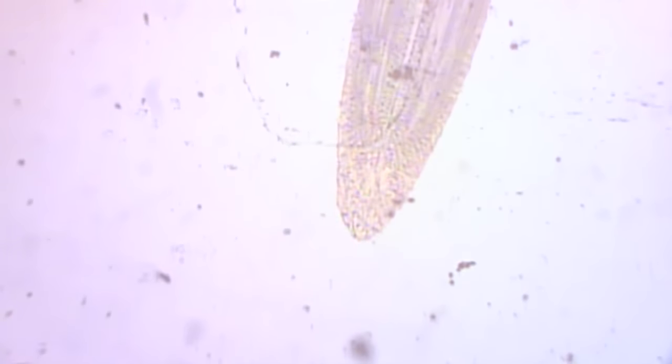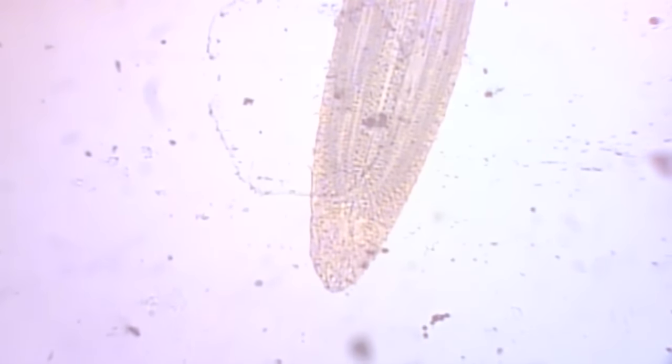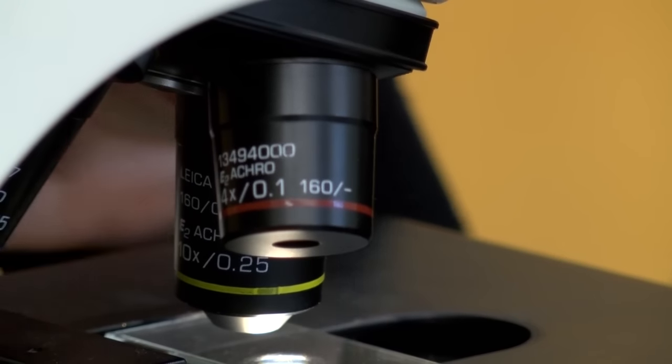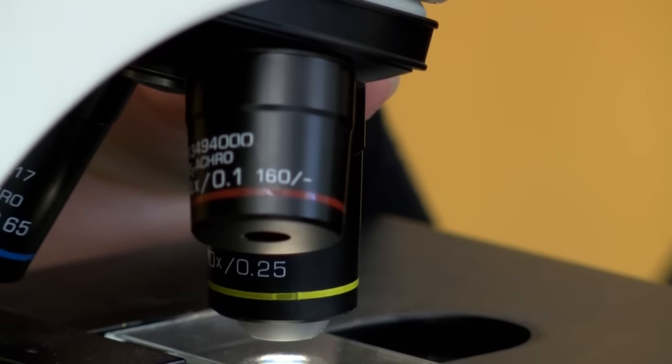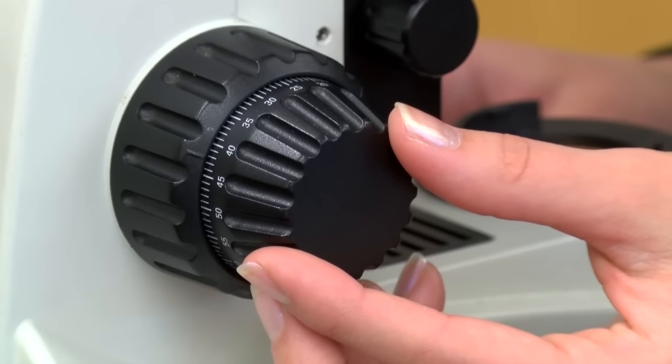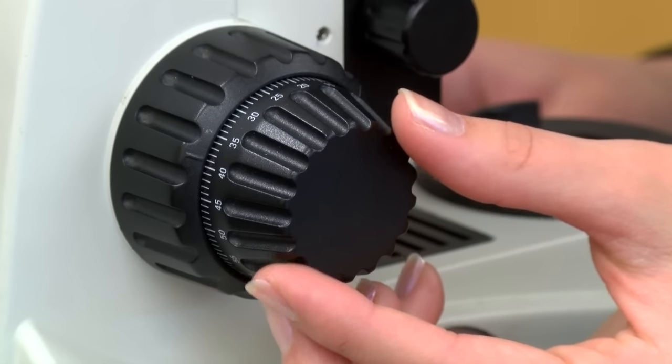Once you have found the specimen on low power, be sure it is centered in the field of view. Then move to the next highest objective lens, 10X, and refocus. Your specimen should be nearly in focus and you should only need to use the smaller, fine focus knob.